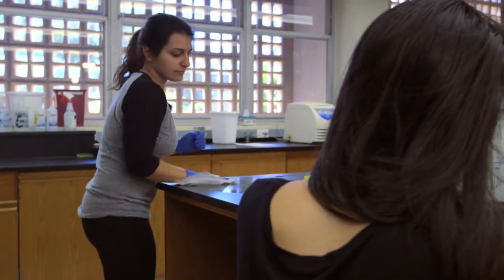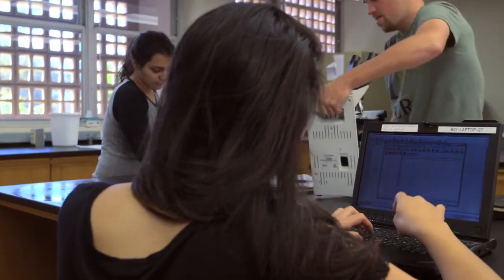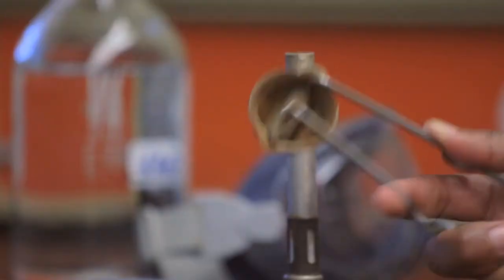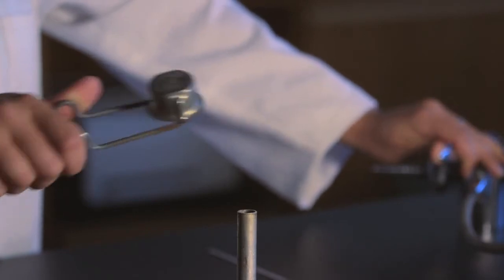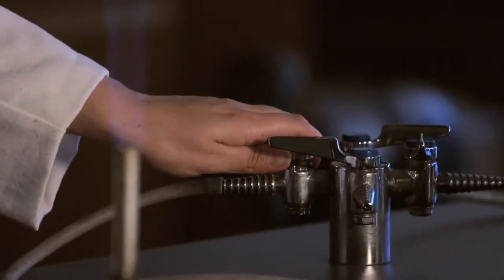Some of the sterilization techniques we are going to perform in this lab involve using open flame. Before lighting the Bunsen burner, prepare and clean your work area. Don't start the flame near equipment such as computers and microscopes. Test the igniter before turning the gas on. Do not touch the metal parts of the burner if you are not certain that it is cool. Never leave the flame you started unattended, and be sure to close the gas tightly when you are done.